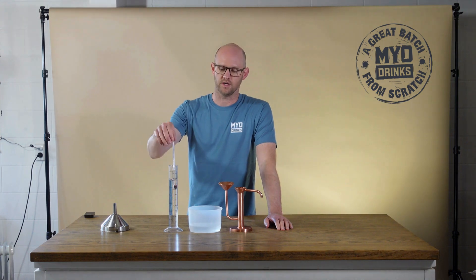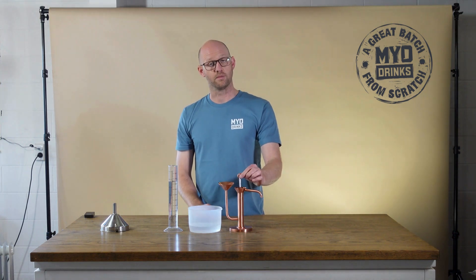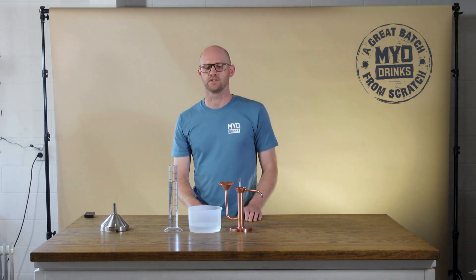You simply take your alcometer and place it in here, and that's going to give you a live ABV reading as you're distilling. And that's another great batch from scratch.